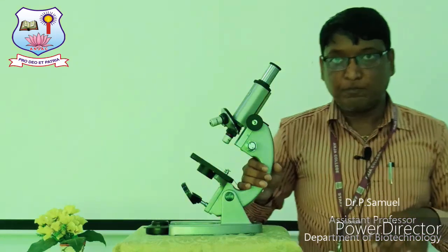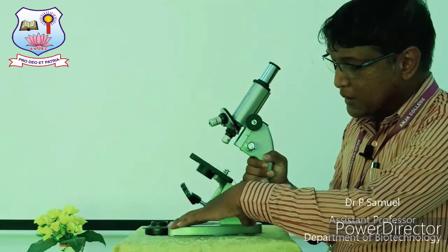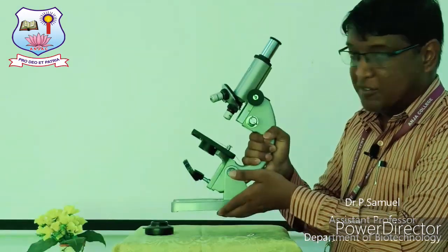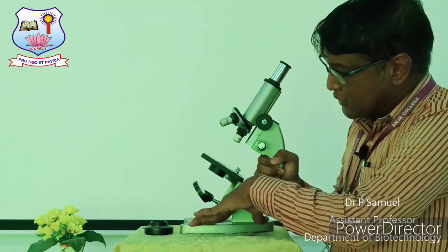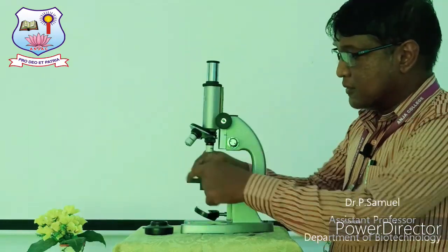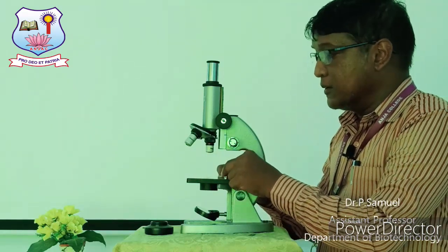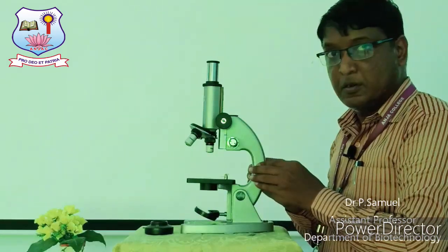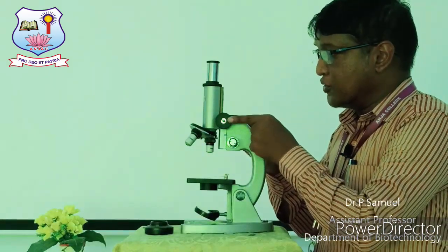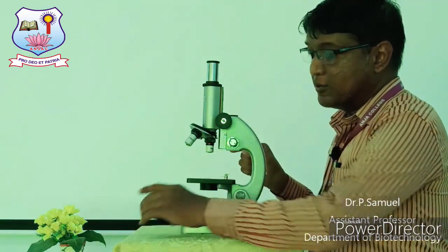And this is the neck of the microscope, which is used to hold the microscope tightly, and this portion is called the base. This is the mechanical stage. This is the slide holder, which holds your slide in its proper position. This is the coarse adjustment knob, this is the fine adjustment knob, and this one is the diaphragm.